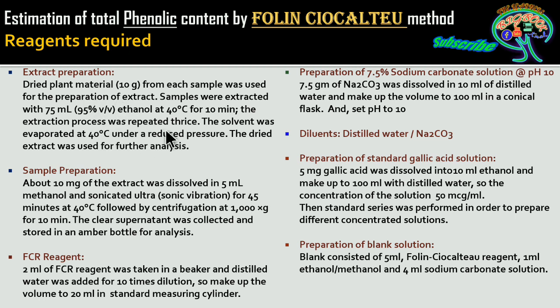After doing this preparation repeatedly, we are going to collect enough amount of the sample, and further this sample will be taken and weighed, and we are going to dissolve it in methanol. Here we have used 10 milligrams dissolved in 5 ml methanol, and further we are going to sonicate it with ultrasound for 45 minutes at 40 degrees centigrade.